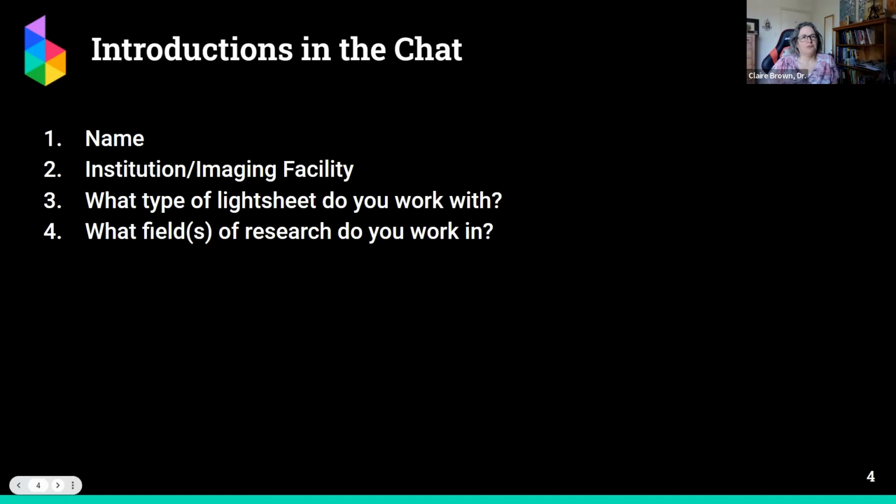I can tell you a little bit about another assay for live cell imaging. We were putting our new Zeiss Lattice Lightsheet through the paces, and we were doing just standard cell tracking overnight, just as a baseline, looking at focus drift, and we know our cells really well, so we know how they migrate and what they look like. And they kept dying, and we weren't sure why. We were using 0.1% laser power.